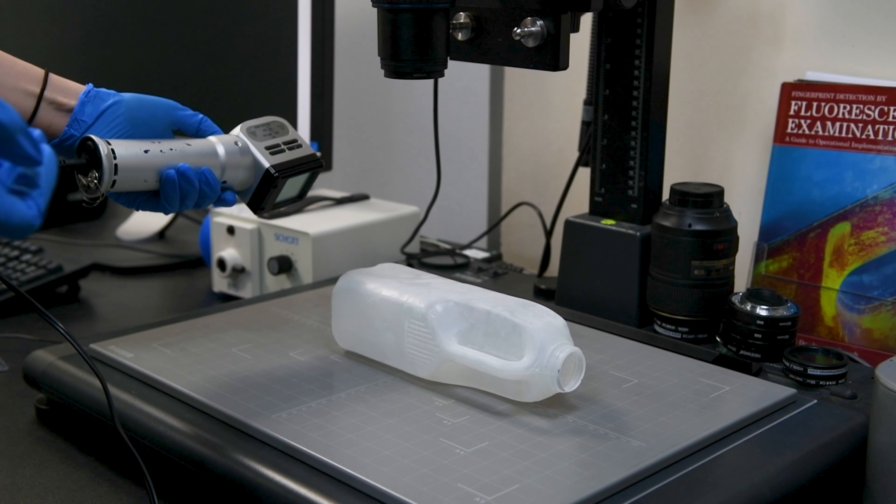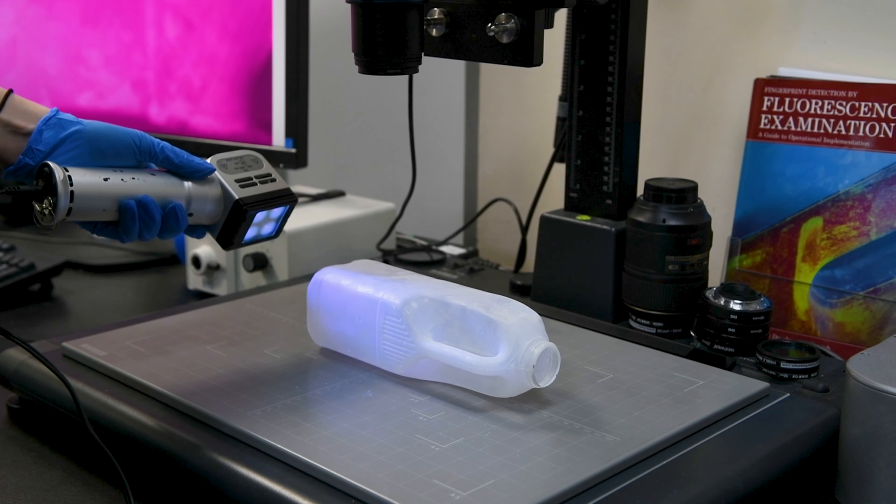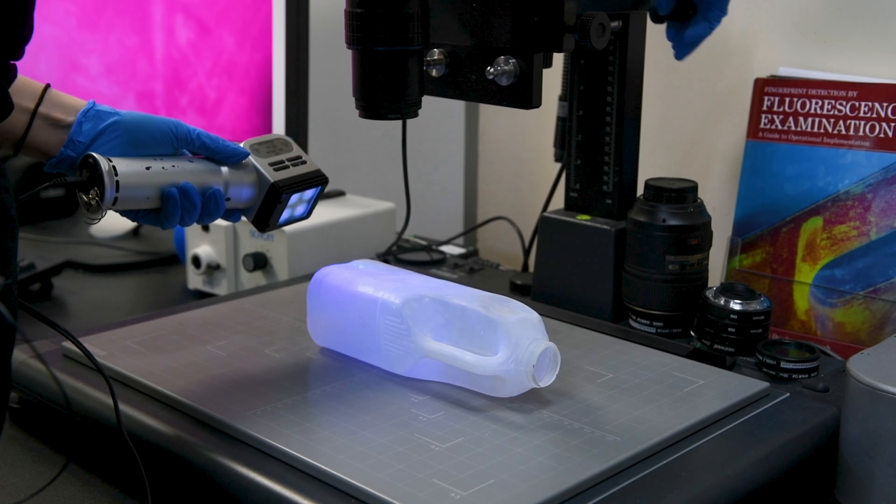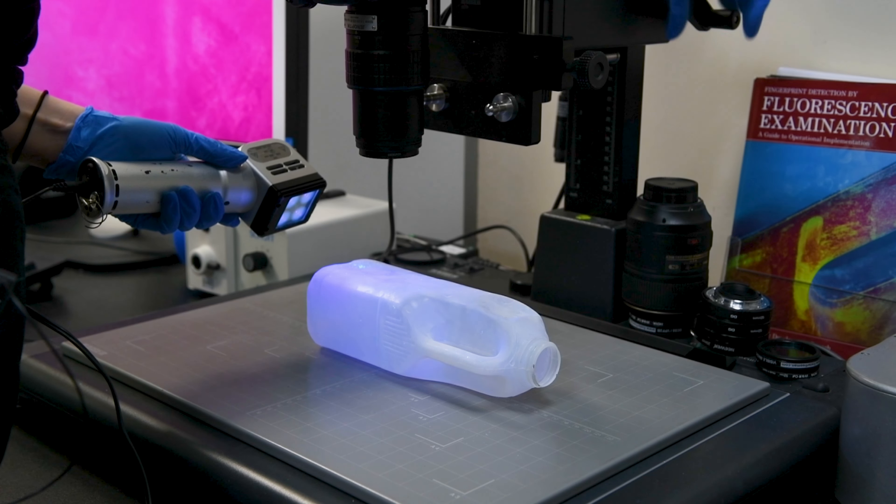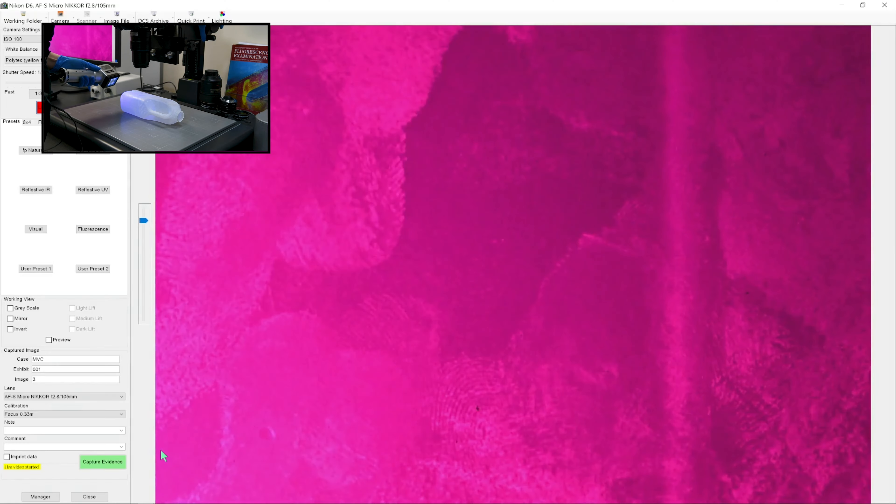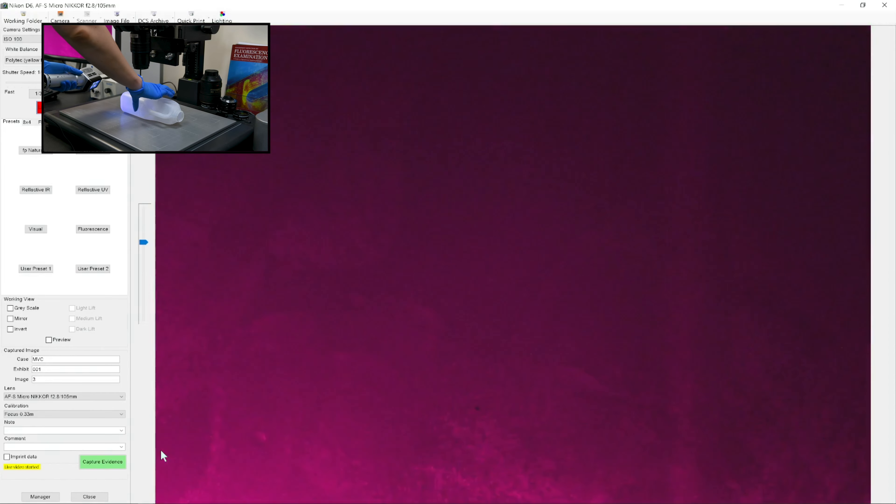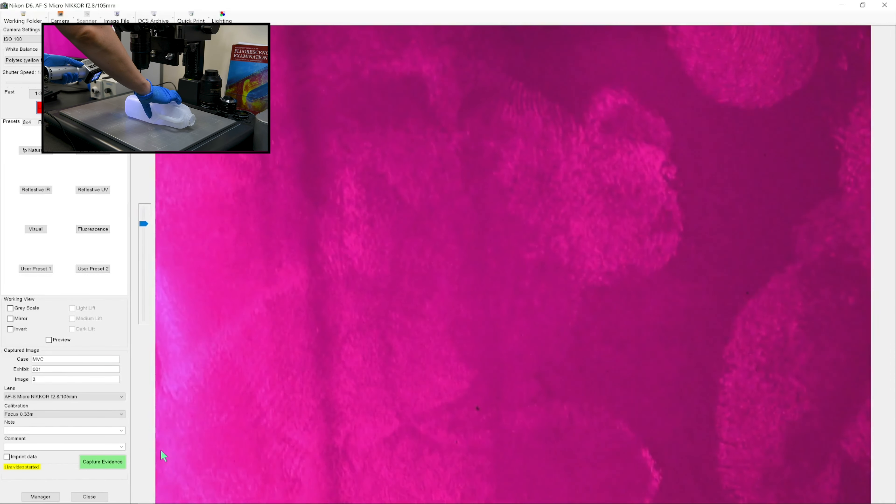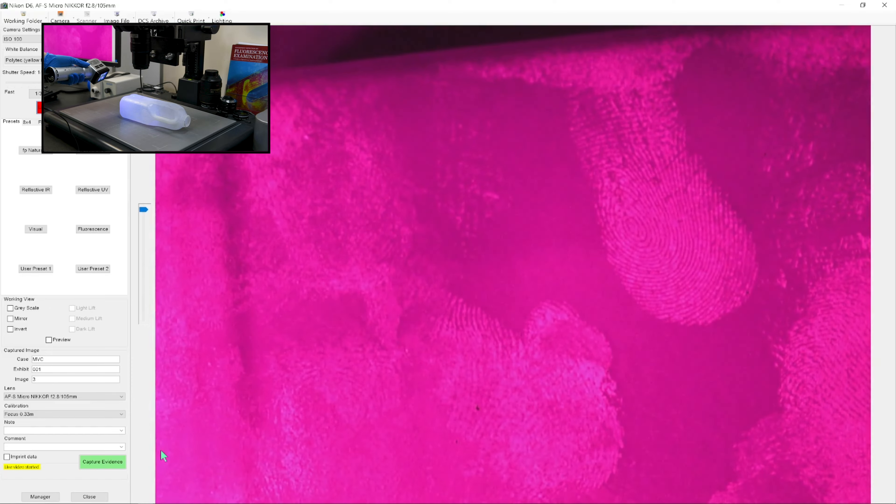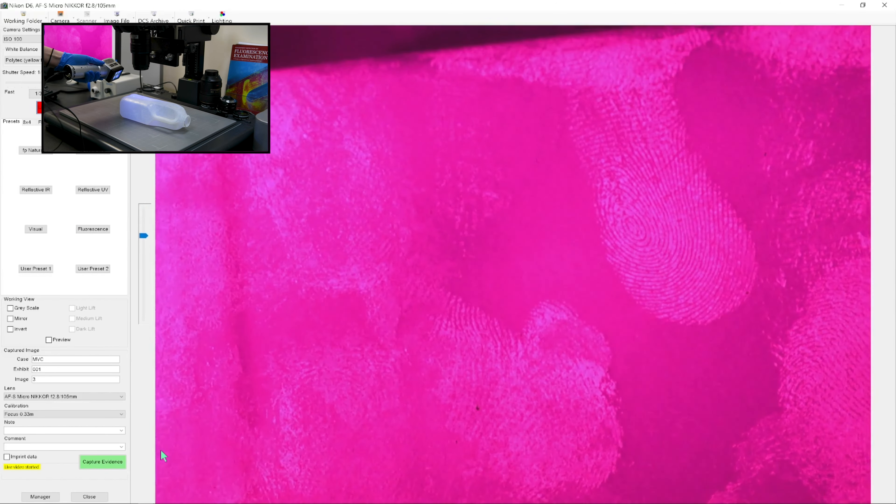What I'm going to do is illuminate the surface and then use the live mode of the camera to get my image into focus and search for finger marks.